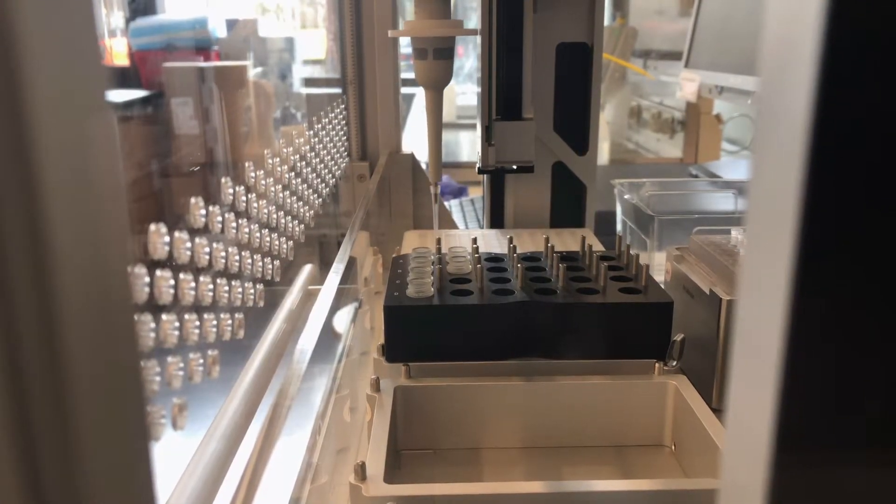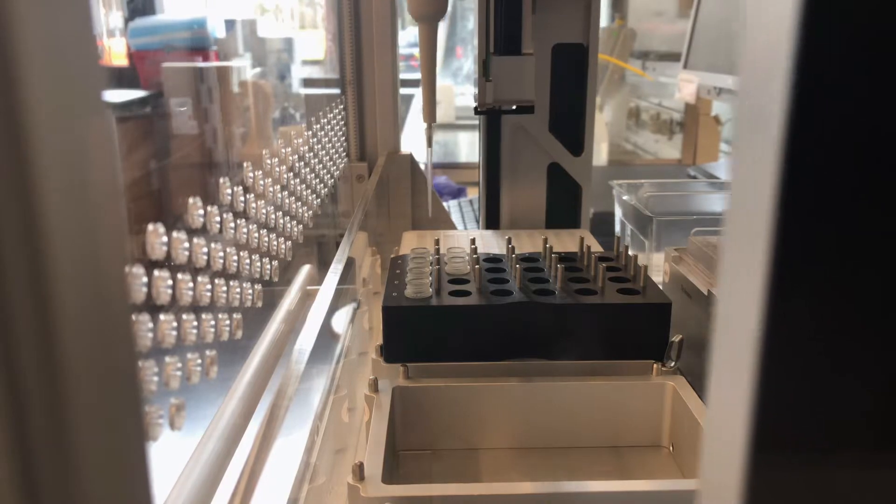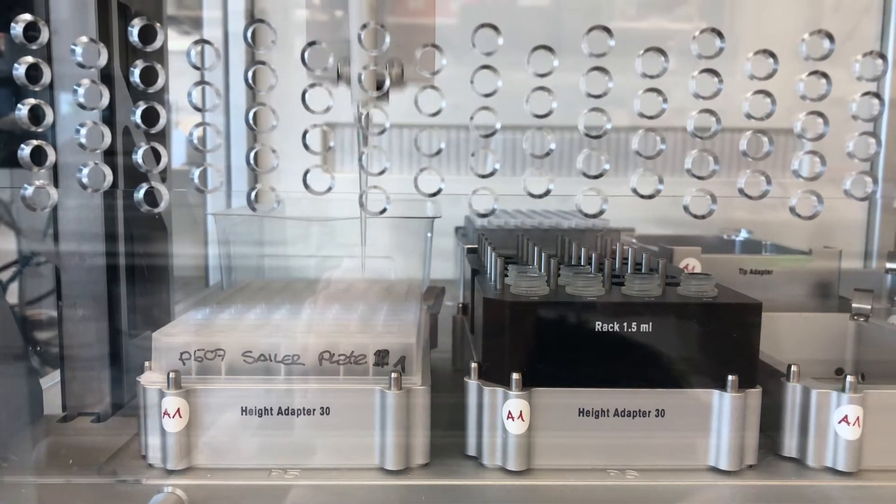When we have a lot of samples, we use a pipetting robot to be more accurate with the volumes.